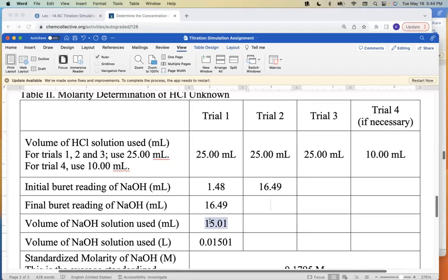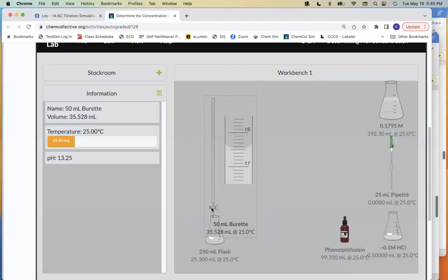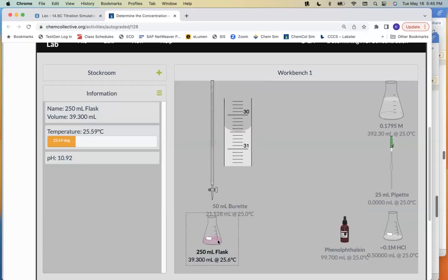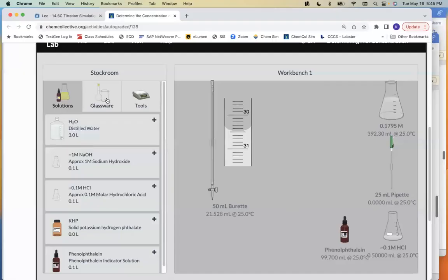And I already have an answer right here. I used 15 mL, and I know I went a little overboard, so I'm going to go a little under that. I'm actually going to go to about 14 mL first, and then I'm going to slow down. So I'm going to rapidly add 14 mL to start. Oh no! And that was too much. I definitely over titrated, so I better do that again. That was bad. Let's do it again.